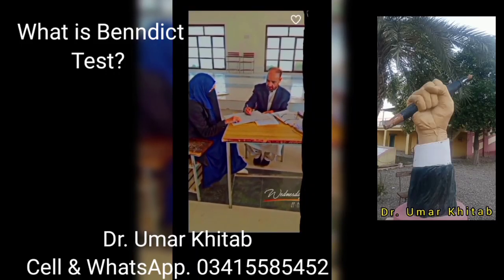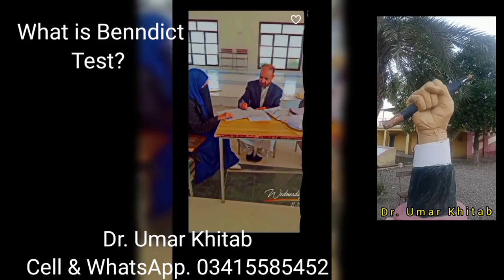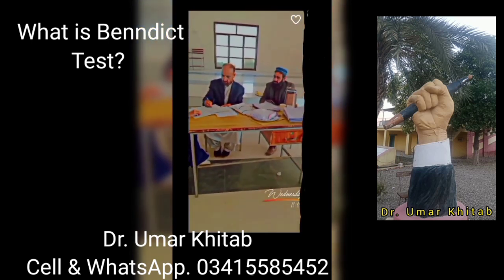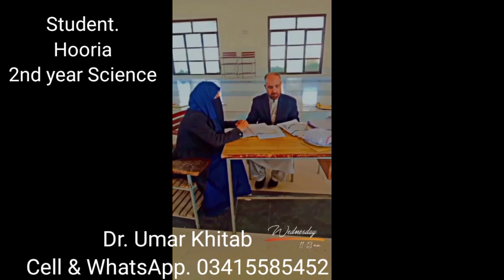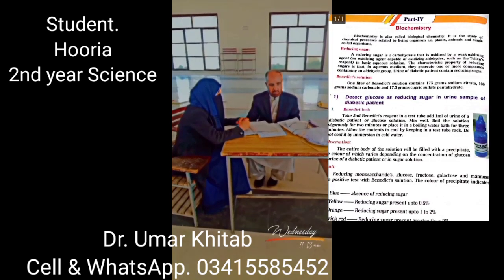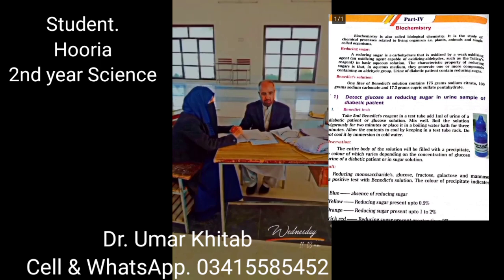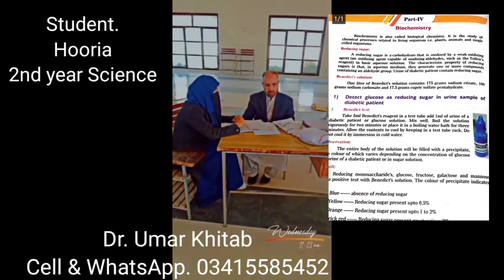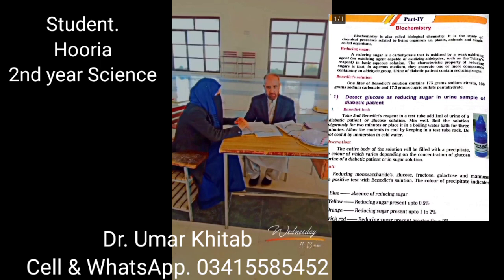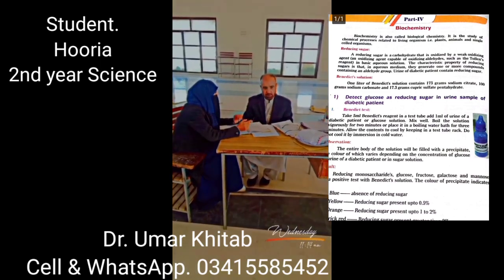Dear student, in the practical examination, today you performed a Benedict test. What is the procedure of this test? Going to our procedure, we are using a pipette accurately by taking 5 ml Benedict reagent and slowly transferring it to the test tube.